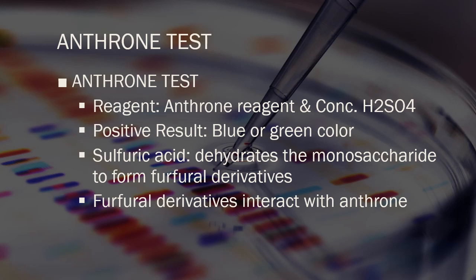Let's take a look at the two general tests for carbohydrates, either just a carbohydrate or combined with other compounds. We did this one previously, so you already know the principle behind this one and the positive result. This is a rapid detection again for carbohydrates in a sample, either combined or free.